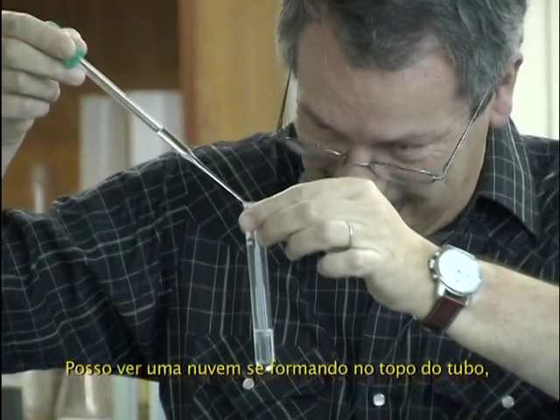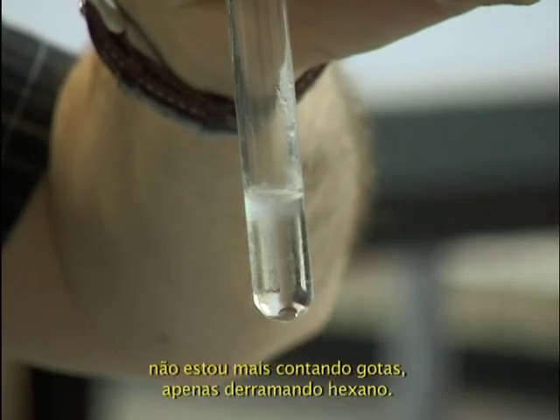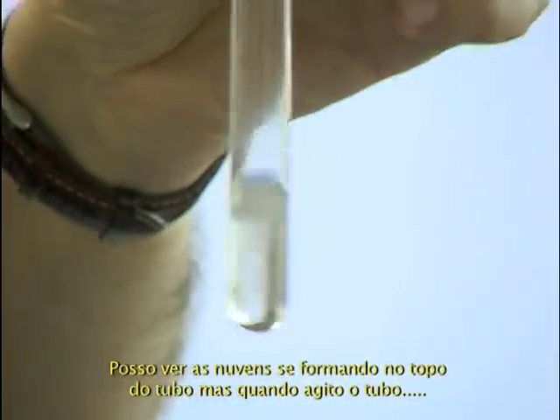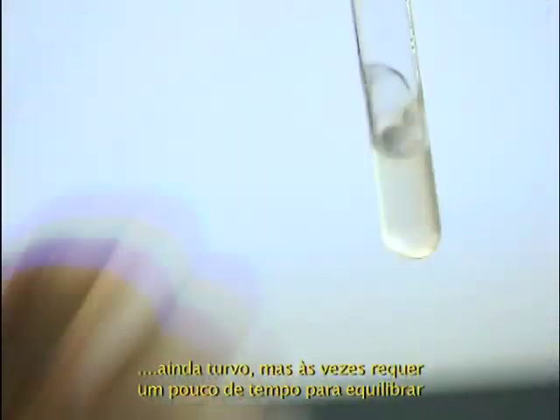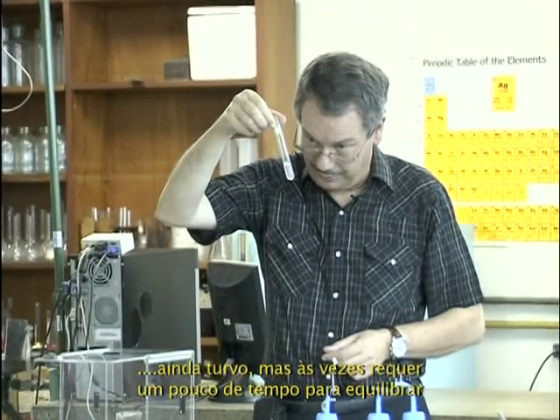I can see cloud going at the top of the tube. I'm not counting drops anymore. You see, I'm pouring hexane in it. I see the cloud forming at the top, but when you shake it well, let's see. It stays cloudy.